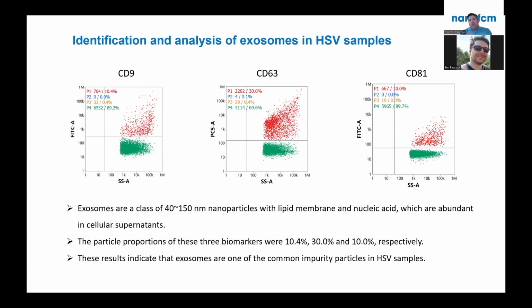And in that vein, we've also done some analysis here of the exosome fraction, and I really like the middle chart here. We can tell the tetraspanins are very promiscuous membrane proteins anyway. They're obviously spread out across a number of these particles, but our CD63, a classical EV exosome marker, we can see is concentrated to the small side now, opposite the G proteins that we looked at. And it is actually around the small side of the distribution where we might think that the extracellular vesicles we're interrogating are concentrated. And the particle proportions here are similar to our virus particles.